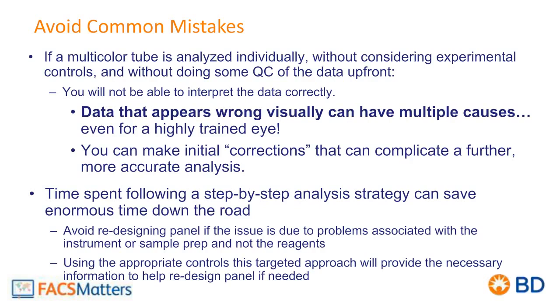For example, if the issues are due to something with the instrument, in other words, if it's a problem that you had with the instrument on that day, maybe the panel worked fine, but you aren't getting good data because of the instrument, or the sample prep went wrong, or a particular reagent went wrong. So using the appropriate controls, the targeted approach that we're going to talk about will provide you with the necessary information and help redesign the panel if needed.